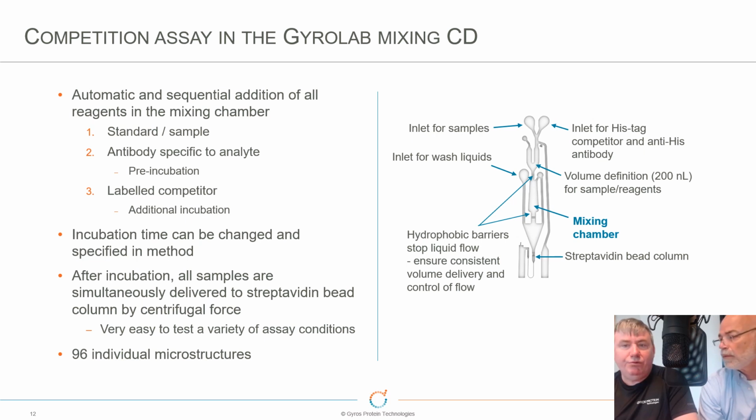Yeah, and you can pre-coat the column, for example, and then run the mixture over the pre-incubated column, or you'll have your capture pre-incubated and then the whole mixture will run over the column. So it gives you a lot of flexibility in terms of assay format, and you can really crank up the incubation times as well. So you can take a normal 1 hour assay and you can really increase it depending on the requirements of your assay.